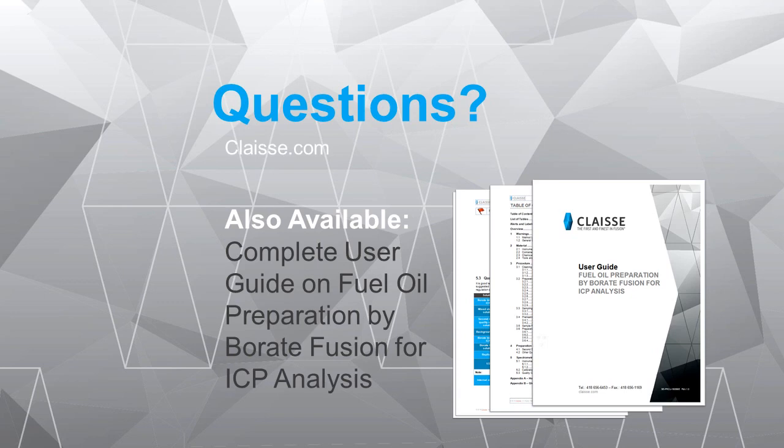One more question. Can the burning pretreatment of the sample be automated? For this application, at first, we didn't test that because we didn't want to make too much change in order to be able to compare both fusion techniques. However, we made some tests with a Claisse M4 automated gas fluxer, and so far we obtained good preliminary results for the recovery of all elements, including sodium. However, more tests will have to be made before we are able to provide a sturdy automated burning method.